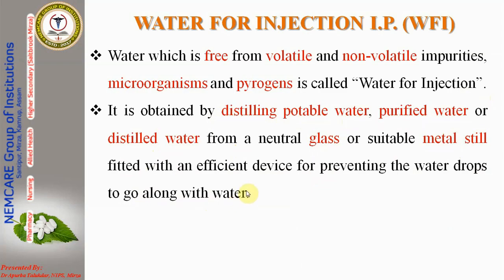So generally this water for injection is prepared from distilled potable water, in the sense of drinkable water, the purified water, or from the distilled water by using glass or mainly stainless steel apparatus.